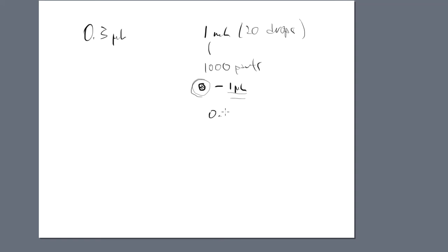I need 0.3 microliters to be injected. Folks, that's like a fraction of a drop. That's all that we need. The only thing that I'll say about the GC is that there's also a setting called split. And split, basically on the GC side of the house, looks at this 0.3 microliters and it says, you're too strong. That's way too much sample. Can you believe that?